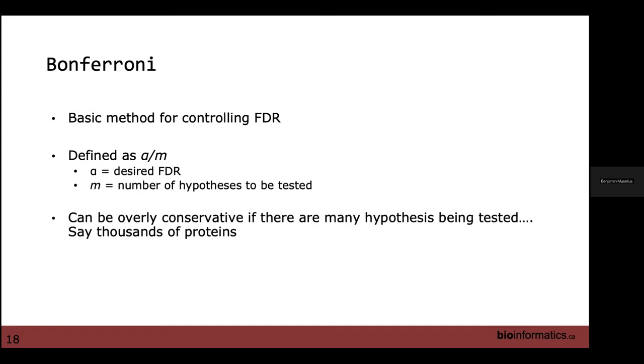There can definitely be cases where you want to really filter your values, you want to be very sure of your differences, but it also causes us to have a high tendency towards type 2 errors, which is false negatives. So there's a large portion of the data when we do this that we're suddenly missing out on that may actually be different.